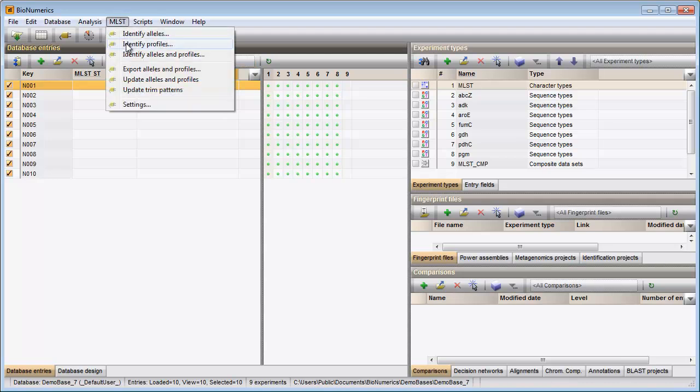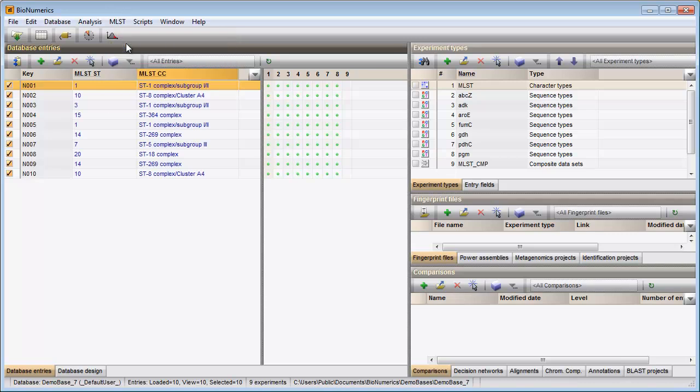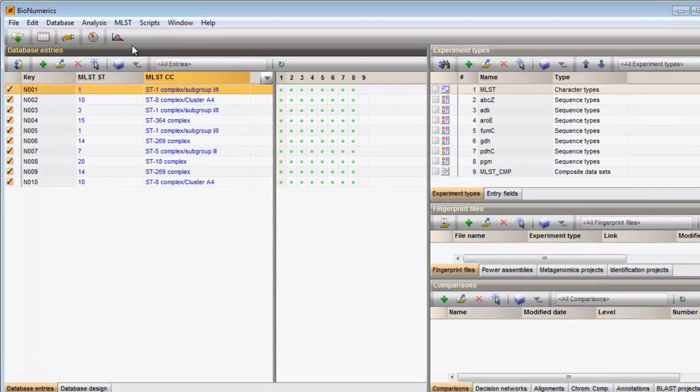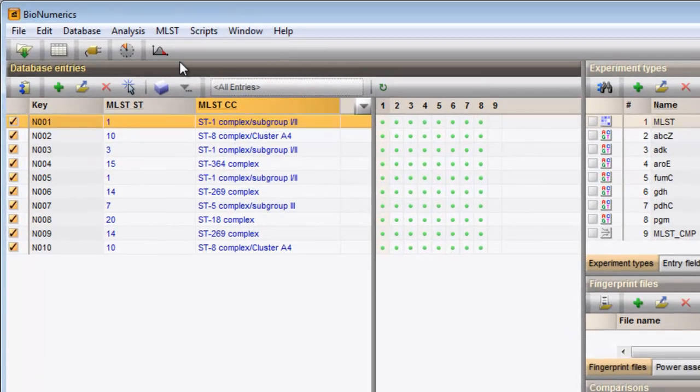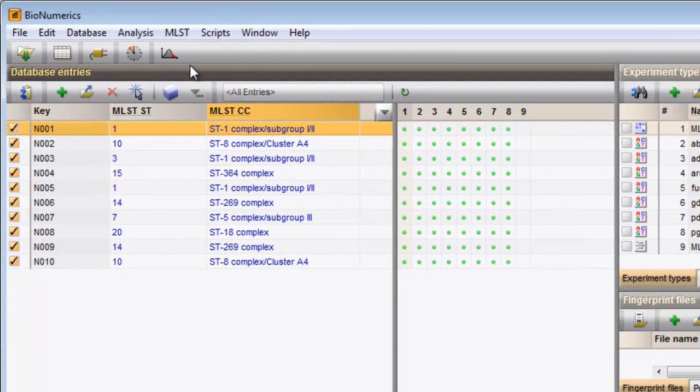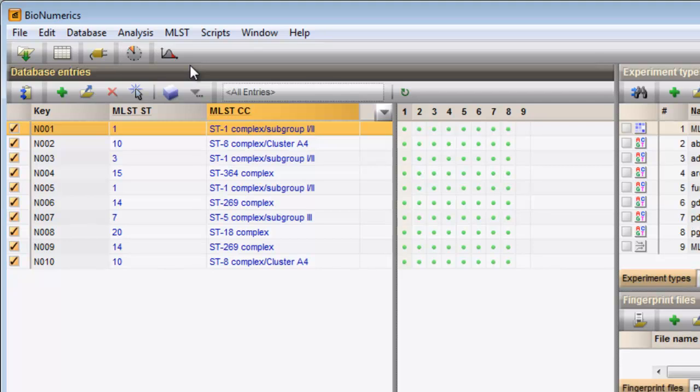With this option, the allele profiles are screened against the online MLST information. The matched sequence types and clonal complexes are displayed in the MLST information fields.